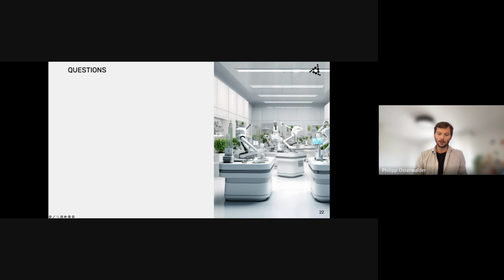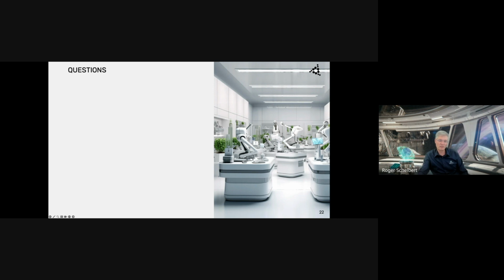Okay. Another question is, how do you proceed or set up a lab automation project to deliver and implement the hardware and software parts? And what are your working steps? So that's more or less as you explained in your presentations. We start a project by visiting a customer, and he has some requests on how he could improve productivity or improve something in automation.